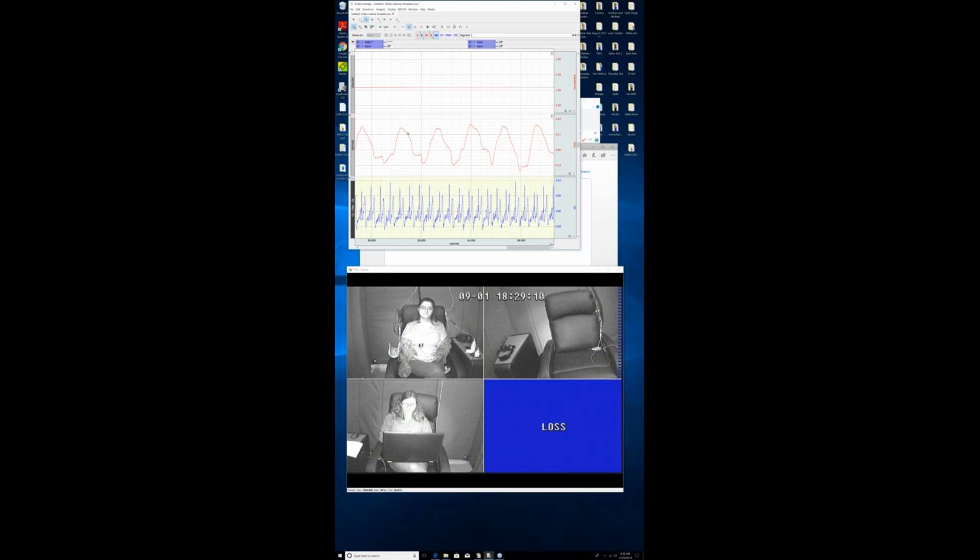What we're looking at here, Sadaf and Brenda for that matter, they're both sitting in the media chairs and they're looking at a video screen, a monitor. Basically everything is built in, all the cables and everything else. It's a little bit cool in here today, so Sadaf's trying to keep warm. Hopefully we'll get some decent signals from her. Brenda is actually trying to moderate at the same time, so we're not collecting data from her. She's multitasking.